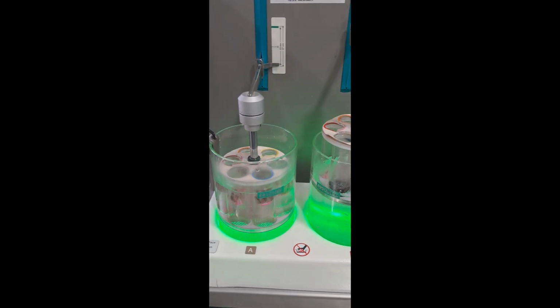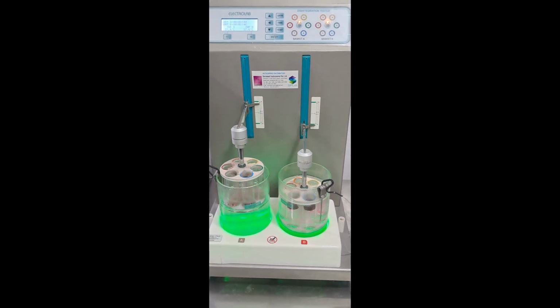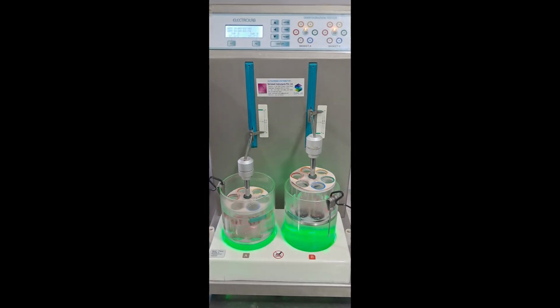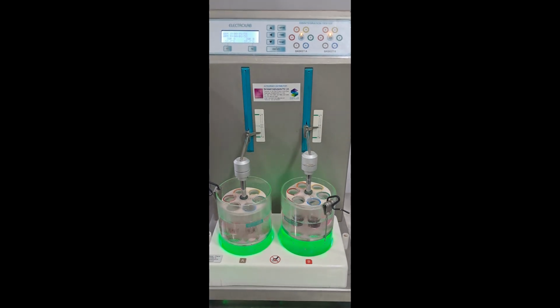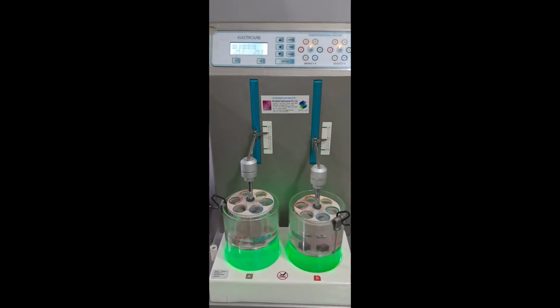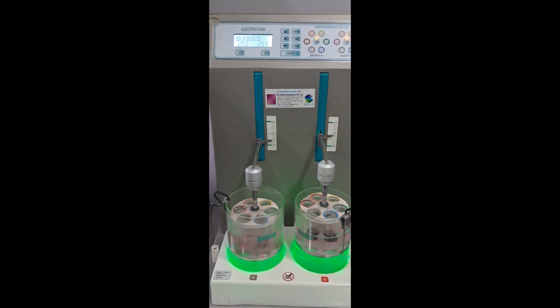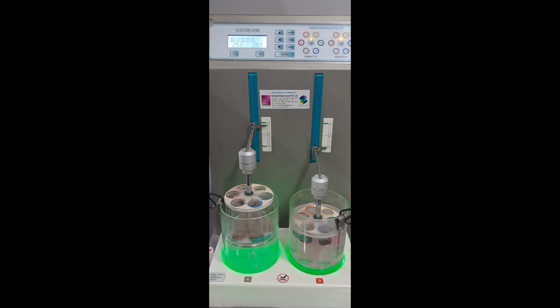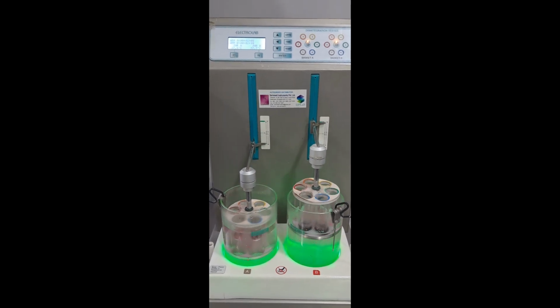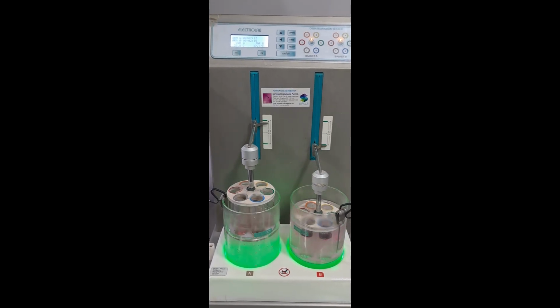Don't be confused about disintegration versus dissolution. Disintegration refers to the mechanical breakdown of the dosage form, while dissolution is the chemical process where the drug dissolves in the liquid. Disintegration is a precursor to dissolution. Disintegration apparatus. The test is performed using a basket rack assembly with tubes and wire mesh immersed in a liquid at a controlled temperature.